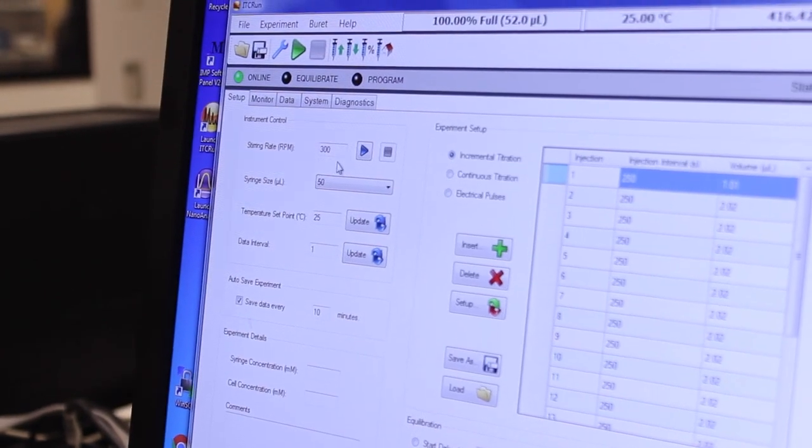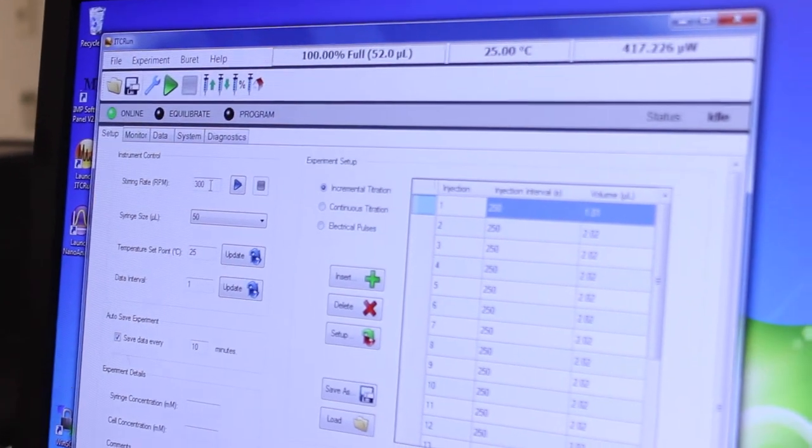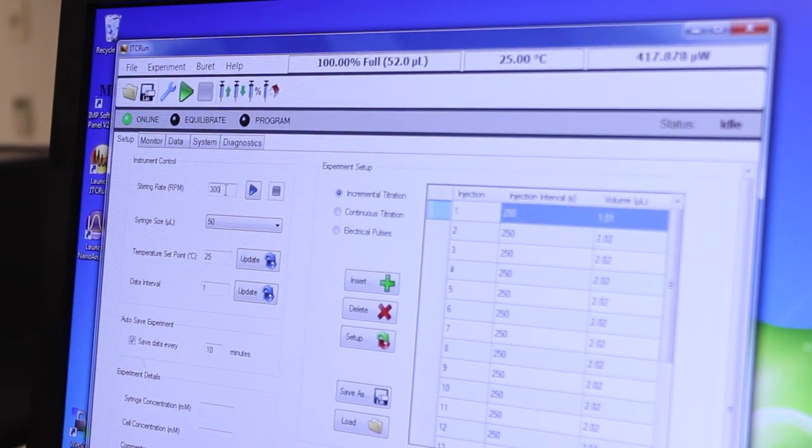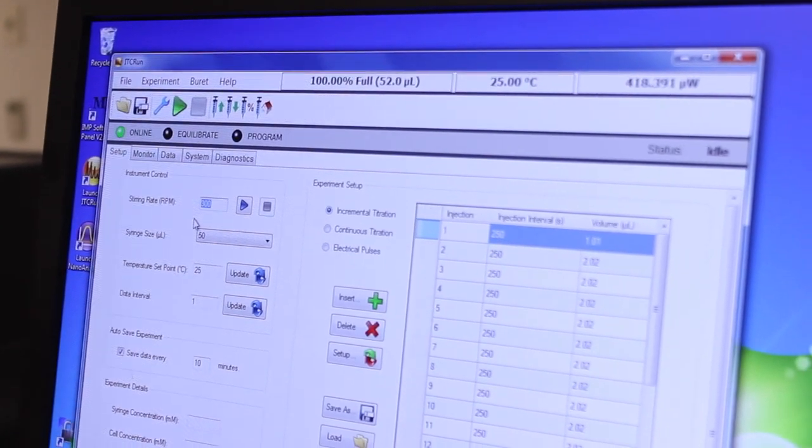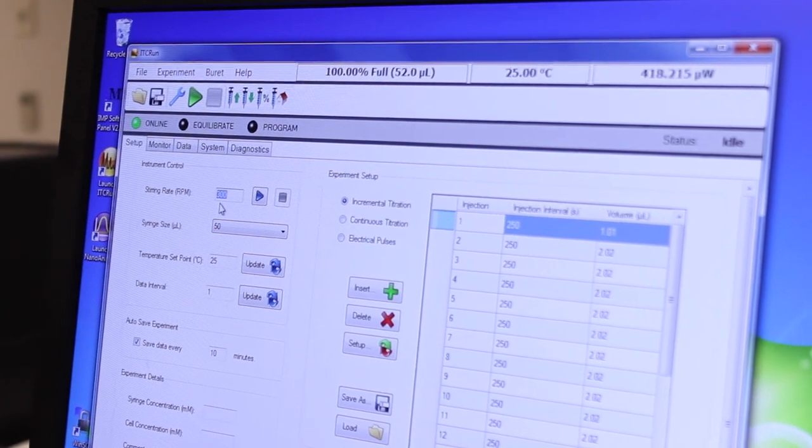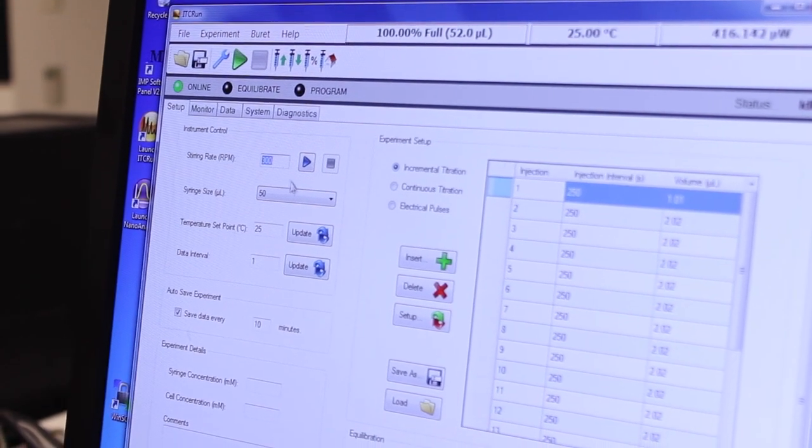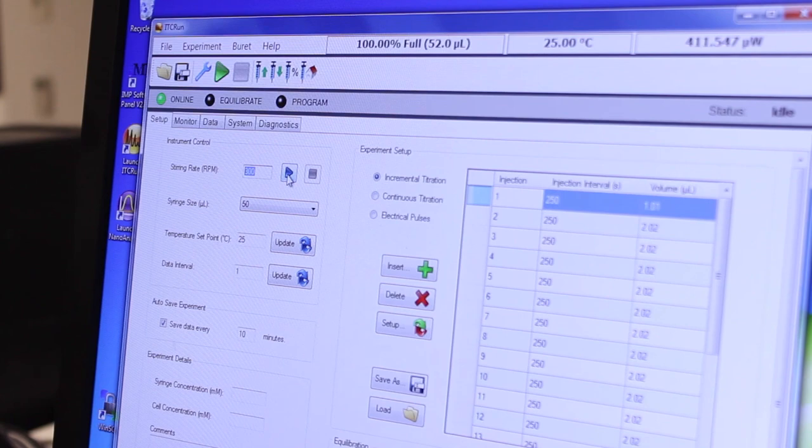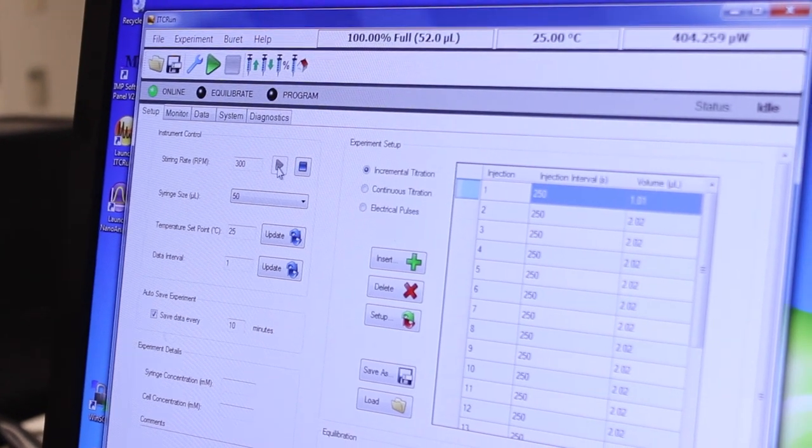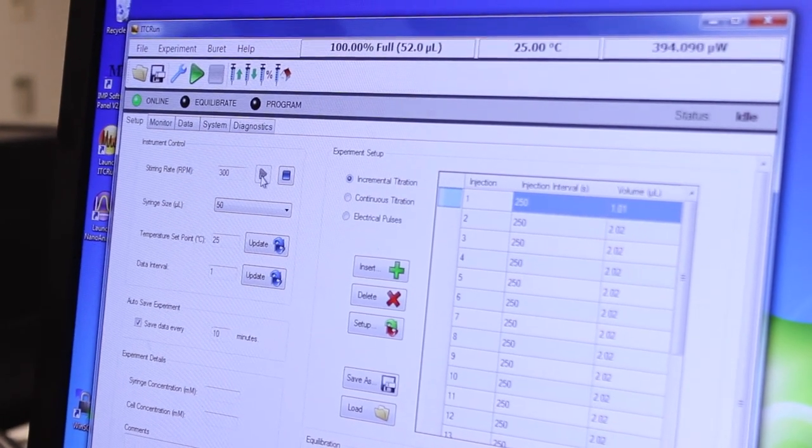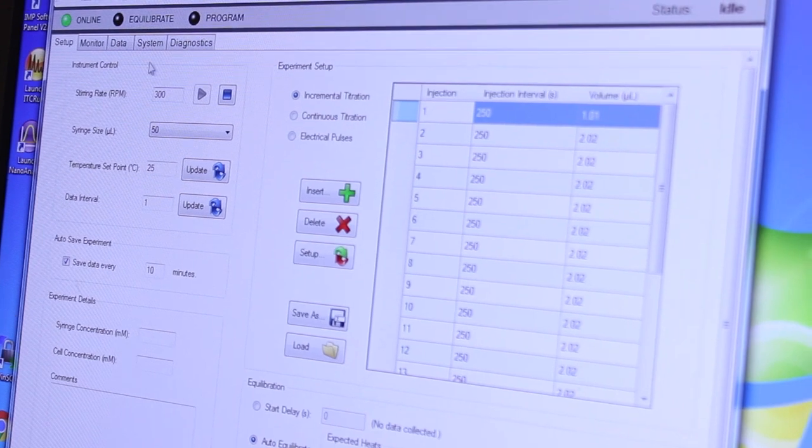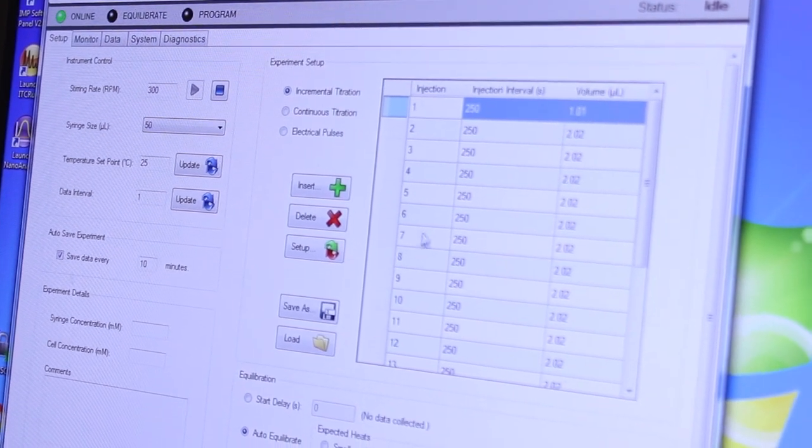In the software first thing I would typically recommend doing is to start the syringe stirring for our instrument typically somewhere between 250 and 300 rpms is a reasonable stirring rate.